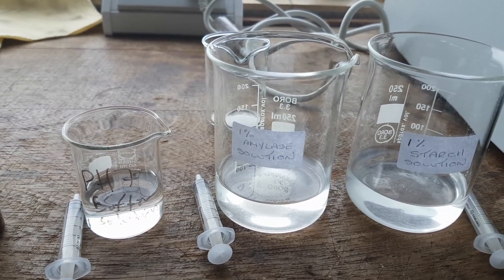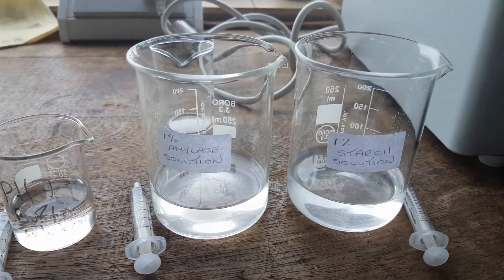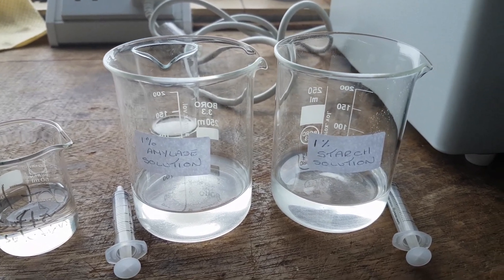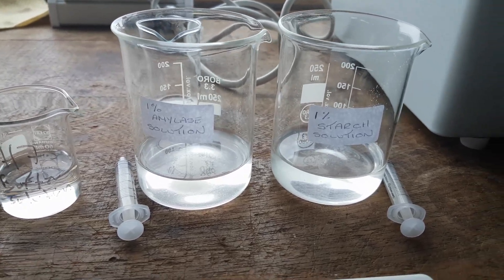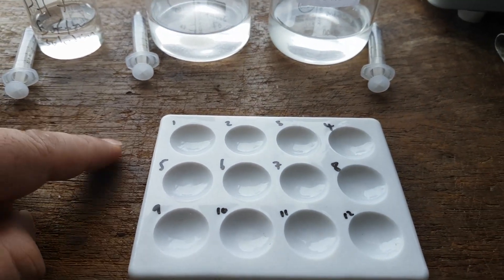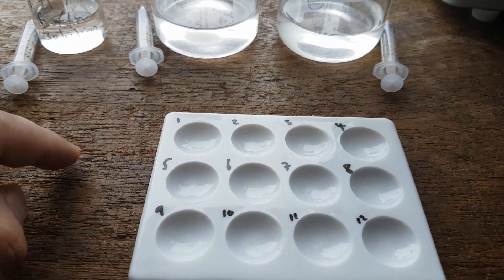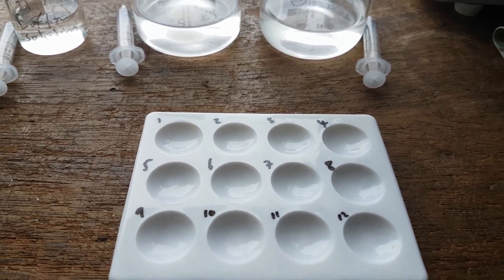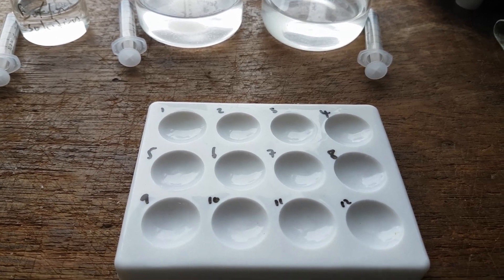We're going to use an amylase solution of 1% and a starch solution of 1%. That is the concentration and each one will have its own 2.5 ml syringe. We will also need a spotting tile. Now I've numbered them. The reason why I've numbered them is so that I know the order in which I'm going to place the solution in once I get to that part of the experiment.